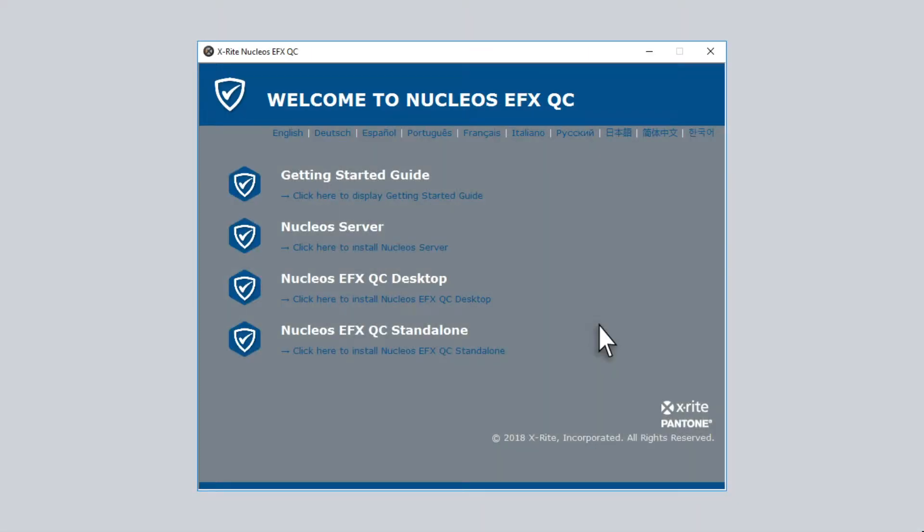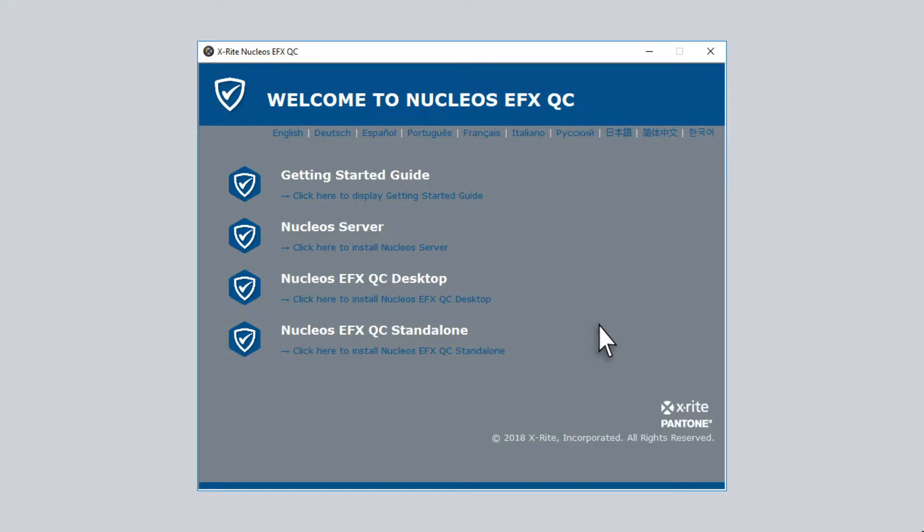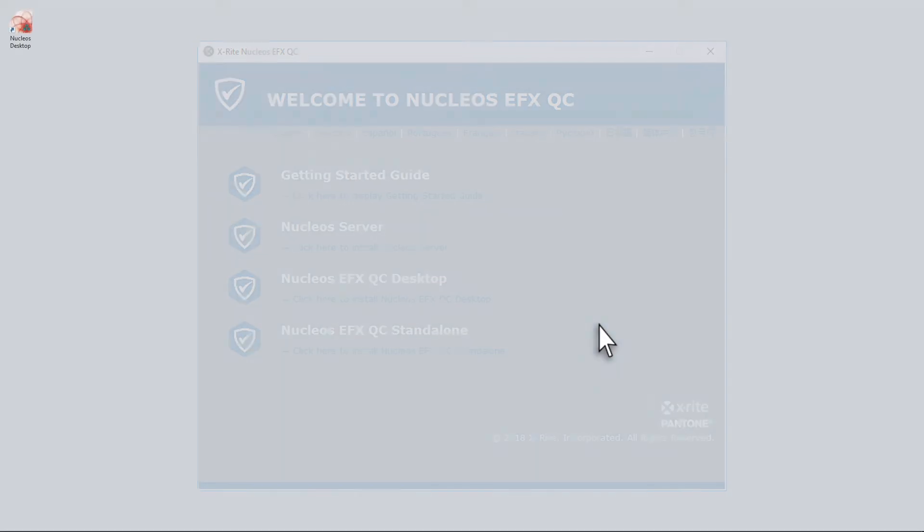Nucleos EFX QC can be installed as a client server or standalone instance. We will be focusing on the standalone version. This installation is straightforward and will create an application called Nucleos Desktop.